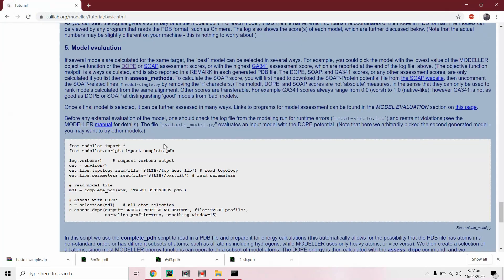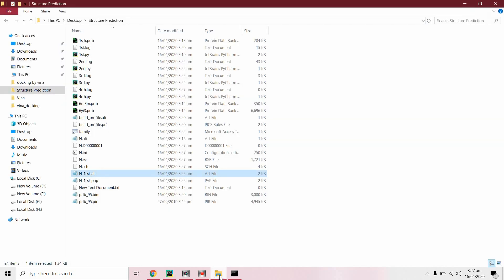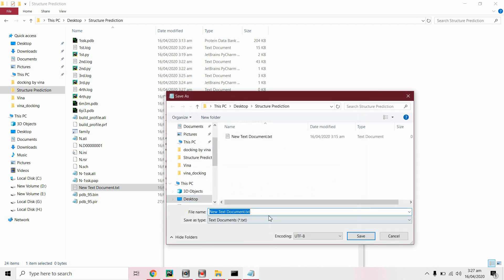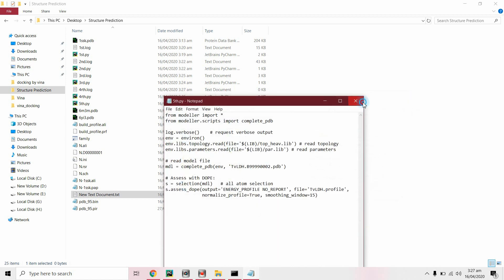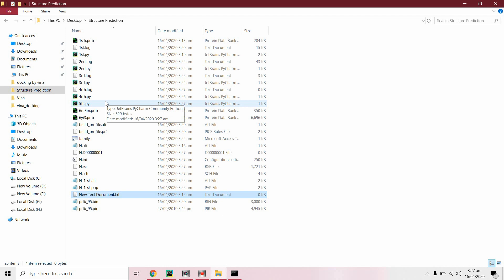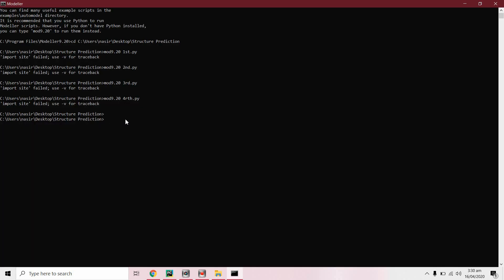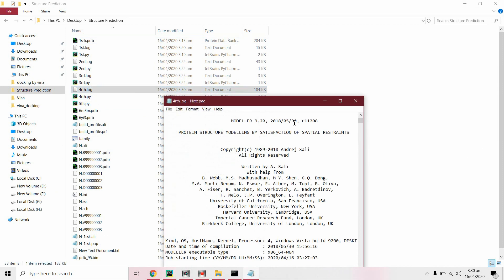Now we will copy the fifth script for evaluation of the model. Save it with the .py extension. We will edit it after model generation is complete. The model has generated three structures. From the log file we can decide which one is better.